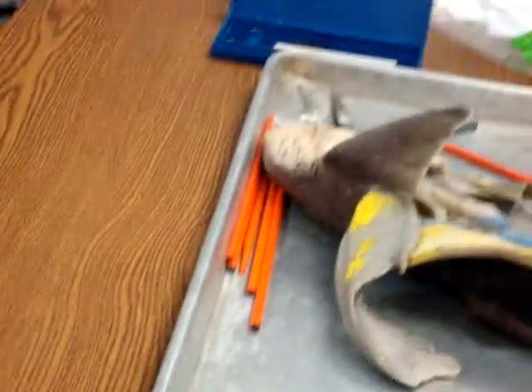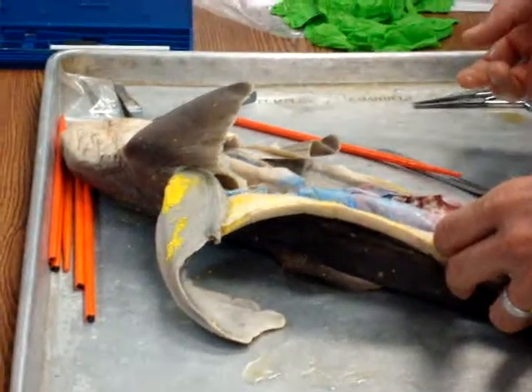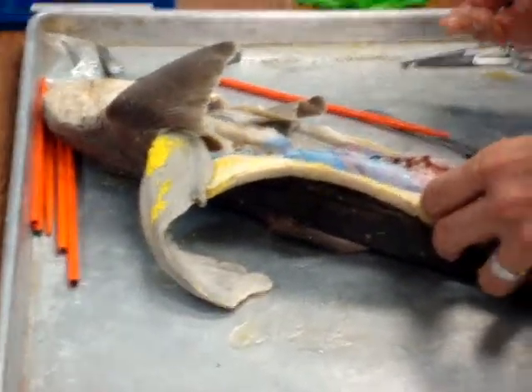All right. Thank you, Mrs. Margraf. Yep. Okay, the cloaca, last portion. It's the catch-all basin, so it gets all the goodies in there.